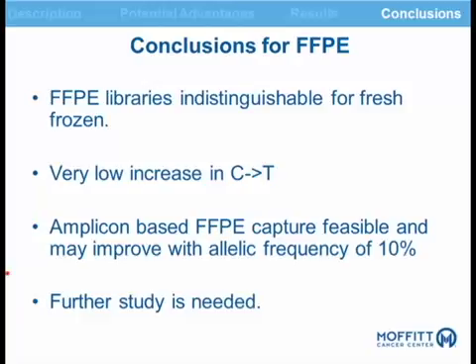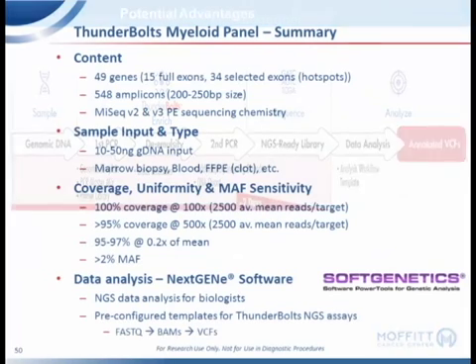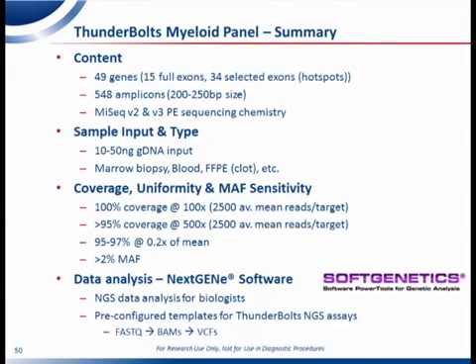Thank you very much, Eric. Wonderful presentation. We have quite a number of questions, so I'm just going to run through these fairly quickly. I will call out the question, and then I will call out the responder. Jeff, this is a question for you. How long does the actual droplet generation process take for a single 8-well chip? It takes about 30 minutes to generate the droplets.